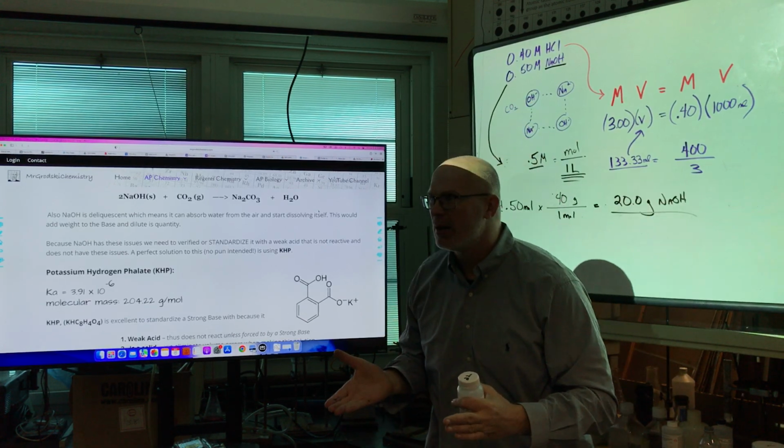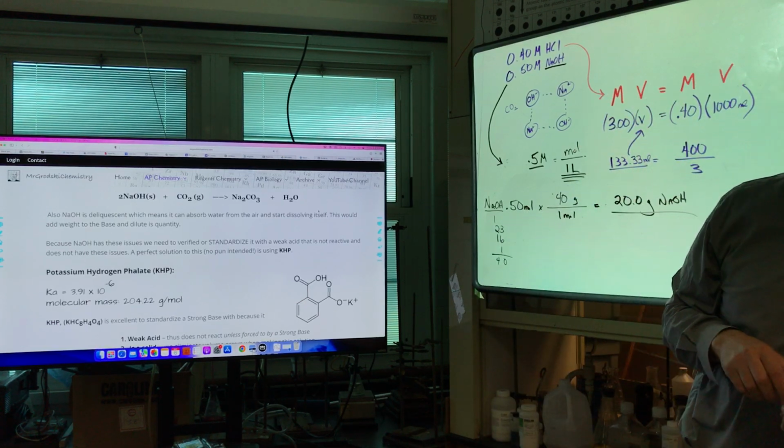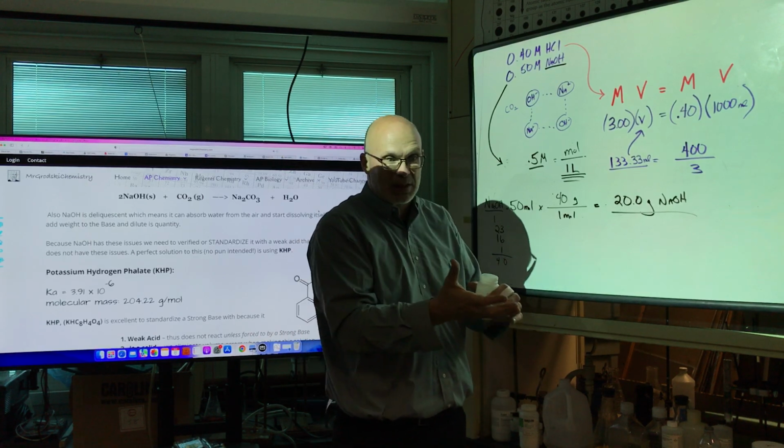So its mass is what? Increasing, all right? And it'll react with the water a little bit. So again, if the mass increases, its molarity is going to drop, right? Because I think it's a certain mass of hydroxide.